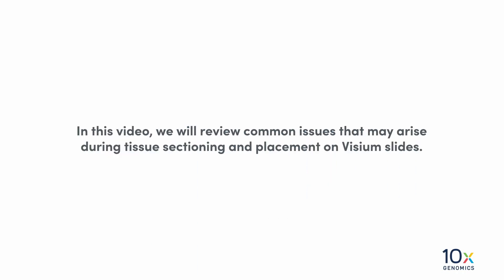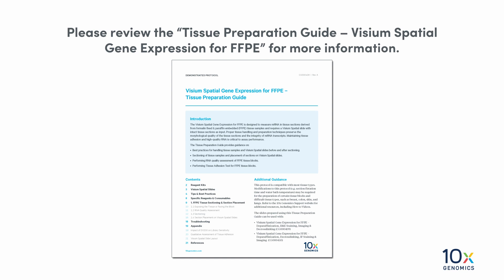In this video, we will review common issues that may arise during tissue sectioning and placement on Visium slides. Please review the Tissue Preparation Guide, Visium Spatial Gene Expression for FFPE, for more information.